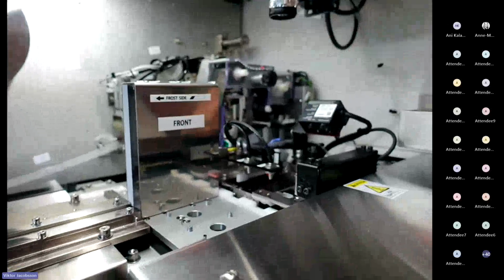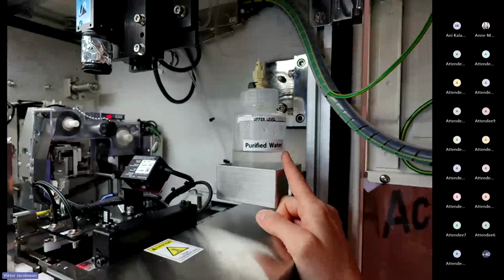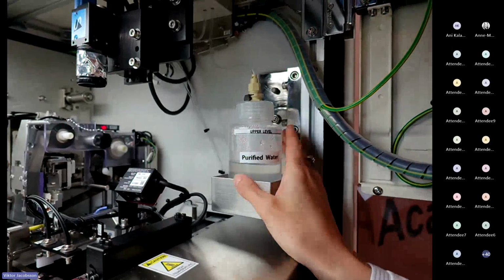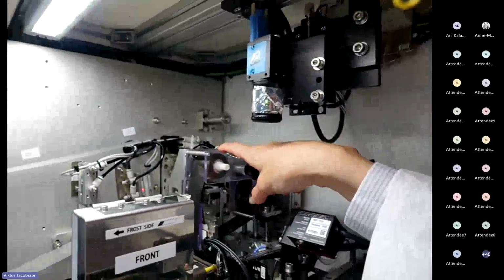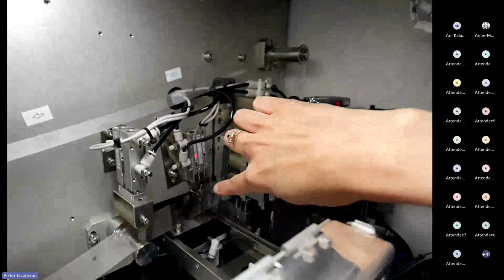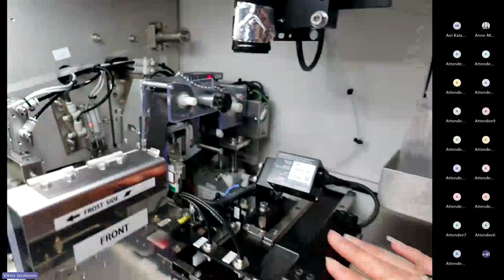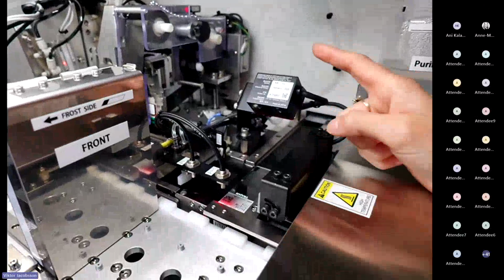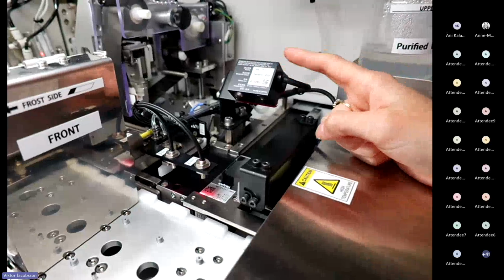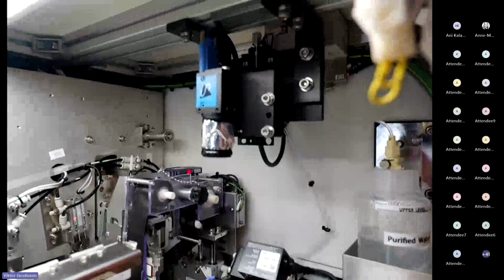Then some mount medium, which is purified water, will be added. This works as a water bath, if we compare this process to manual sectioning. Then there will be a slide print, and then it will go for transfer of the section over here. After transferring the section to the slide, it will come back in this area for extension and for validation of the barcode, making sure that it corresponds with what is on the block. And then it will go for image capture for QC.